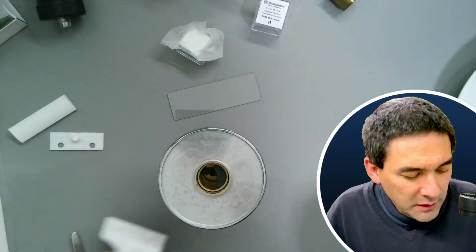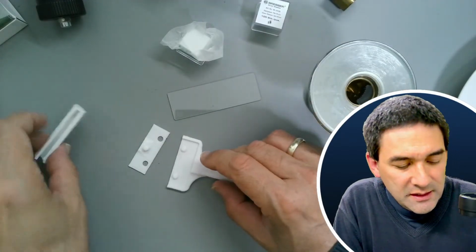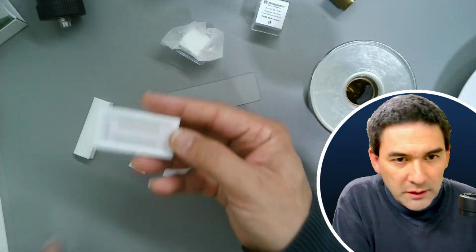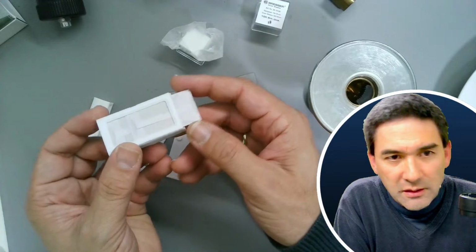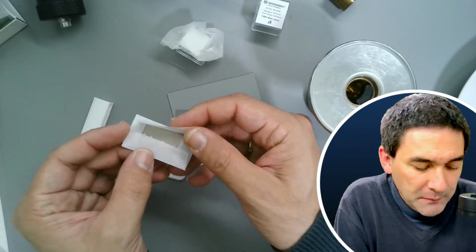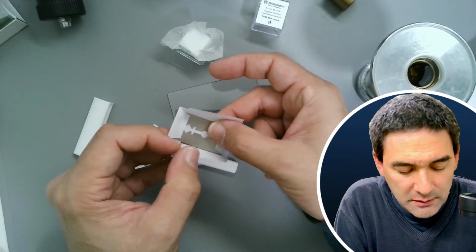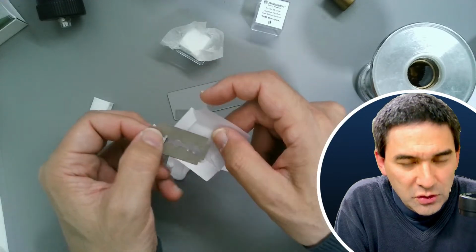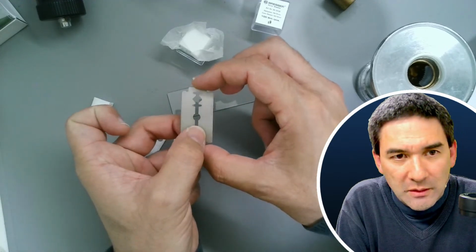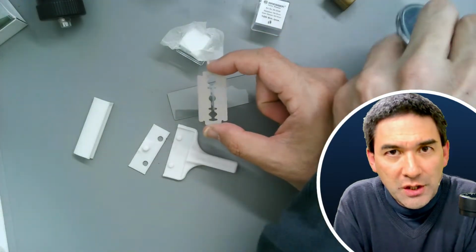So what I'm doing is I've 3D printed myself this little thing here, and this is the cover. This is essentially a holder for razor blades. I like to use those fresh razor blades. They're pretty cheap, really, but also pretty dangerous, obviously. And you cannot use those razor blades as they are because they're too flexible. I'm not able to pass them over like this, also because of course you're going to hurt yourself.